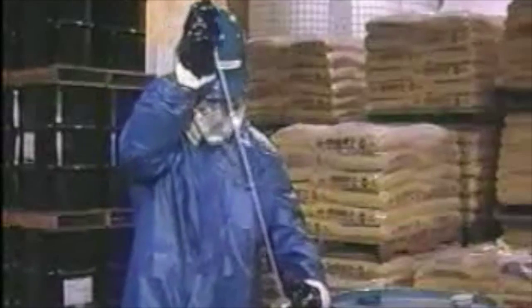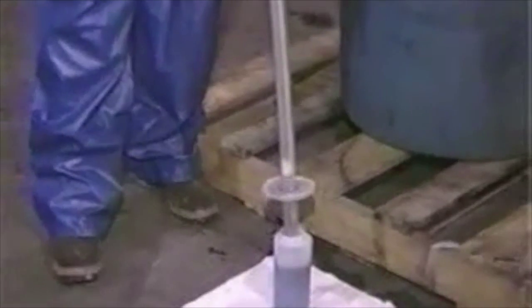Insert the plunge purge tool with the slotted end down into the tube. If the sampler is going to be reused, dampen a towelette, not supplied, with the appropriate solvent. Wad it up and push it through the sampler with the plunge purge tool. Repeat as necessary.